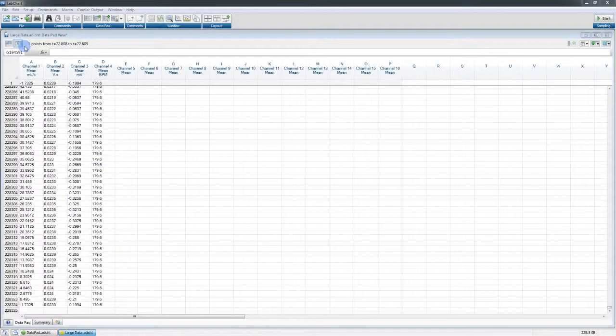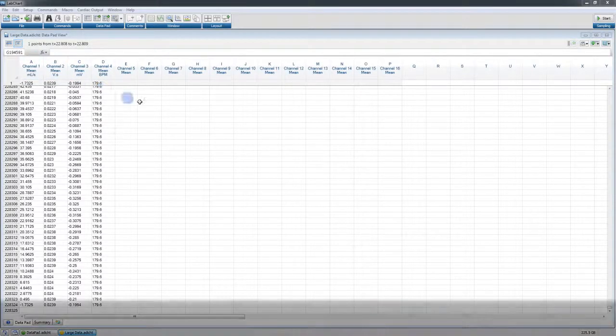The DataPad standard extension is all new in this version of LabChart. Not only is there a new user interface for the DataPad, but the engine that drives it is full of new and fast technologies. The new DataPad is more powerful, and many of the limitations of its predecessors have been removed. In quick summary, the new DataPad supports the following features: an all-new look and feel.